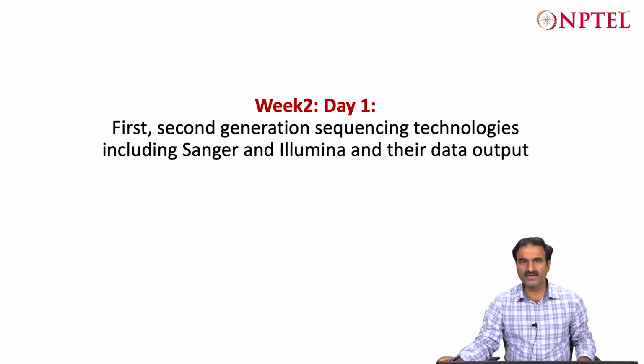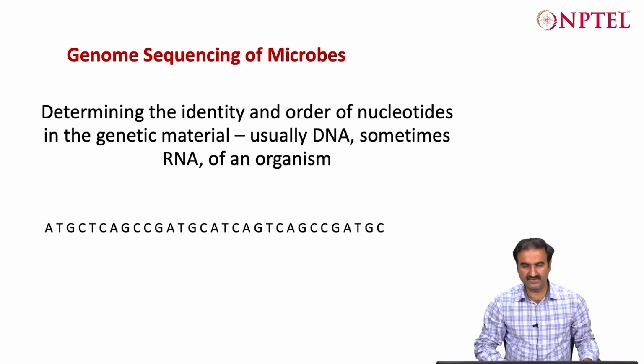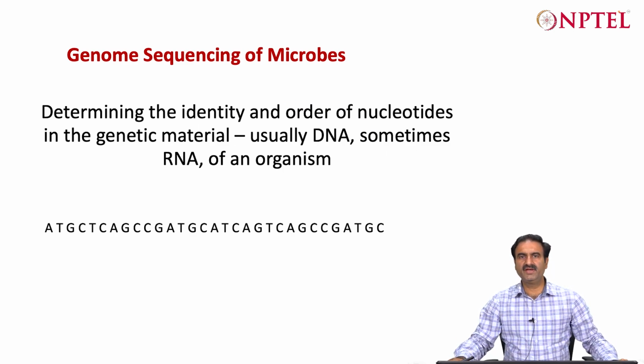Students, in today's class we will learn about the different sequencing technologies, particularly the first and second generation sequencing technology: how they are done, how they evolved, and their advantages and limitations.